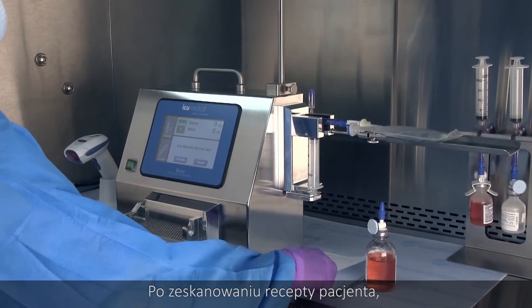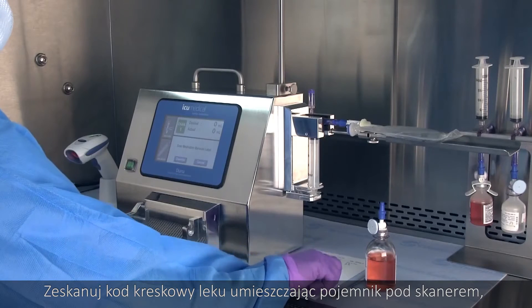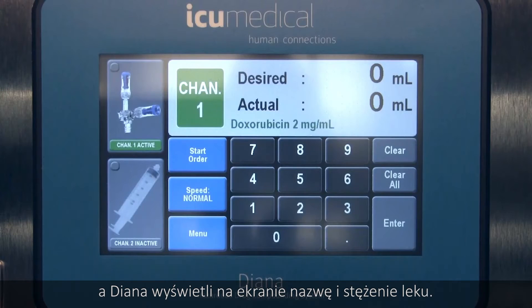After scanning the patient order, another on-screen prompt will direct you to scan the medication barcode. Scan the medication's barcode by placing the container under the scanner and Diana will display the medication name and concentration on the screen.